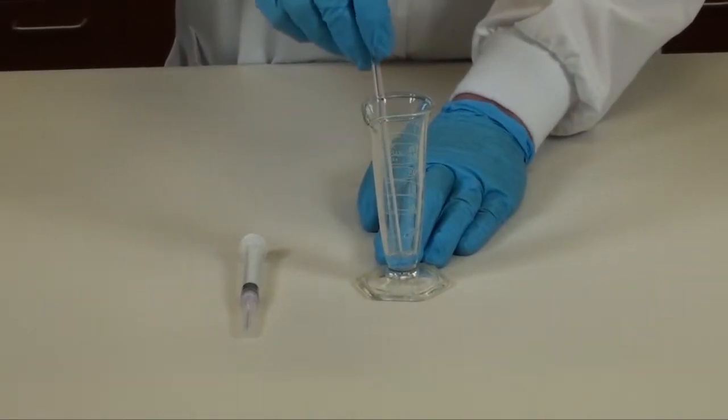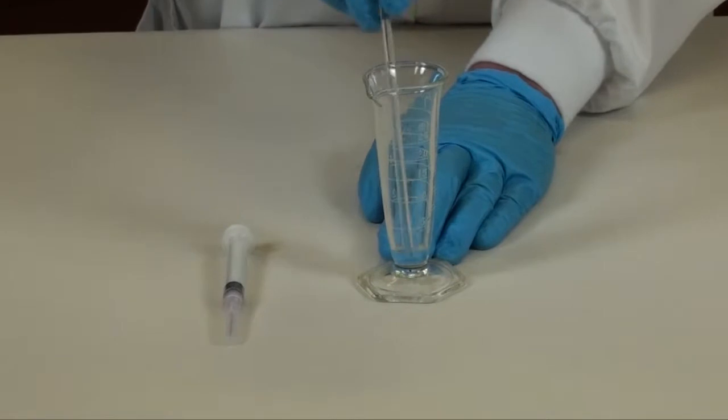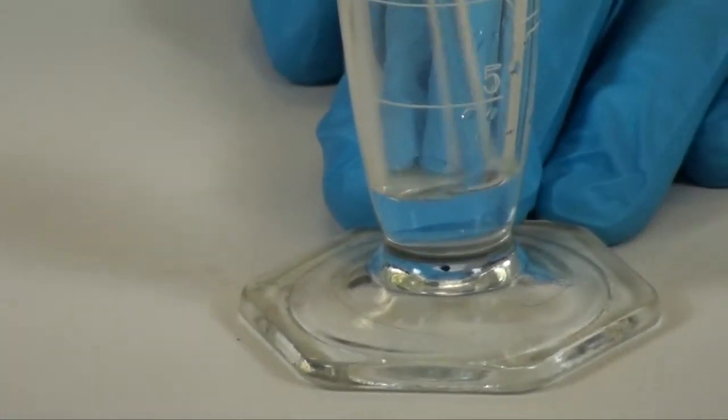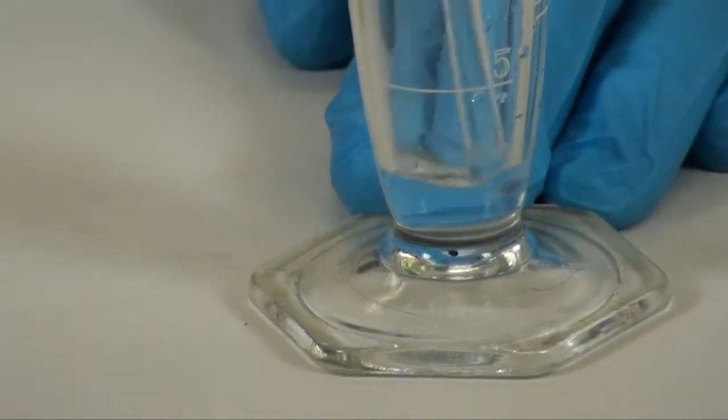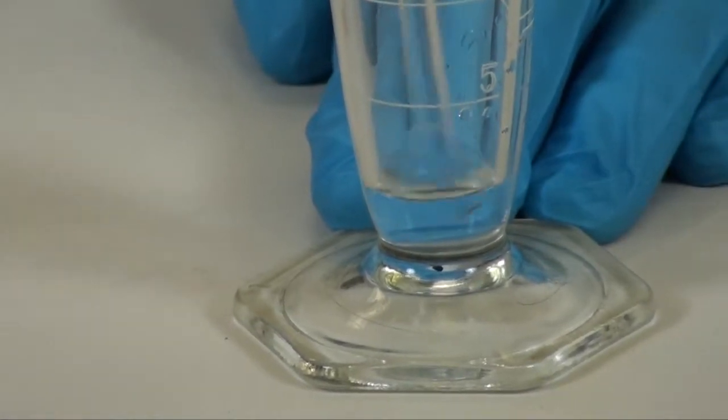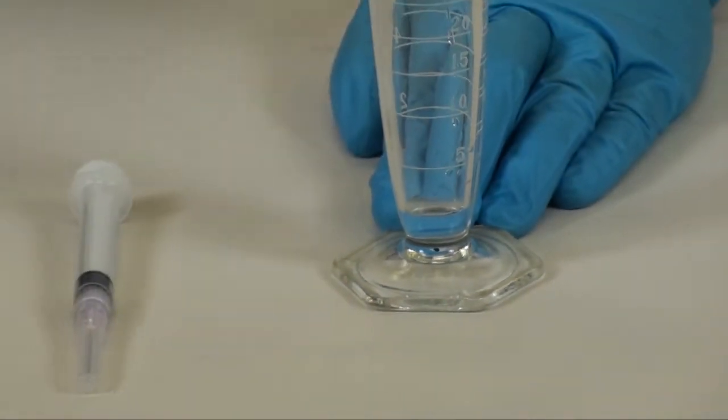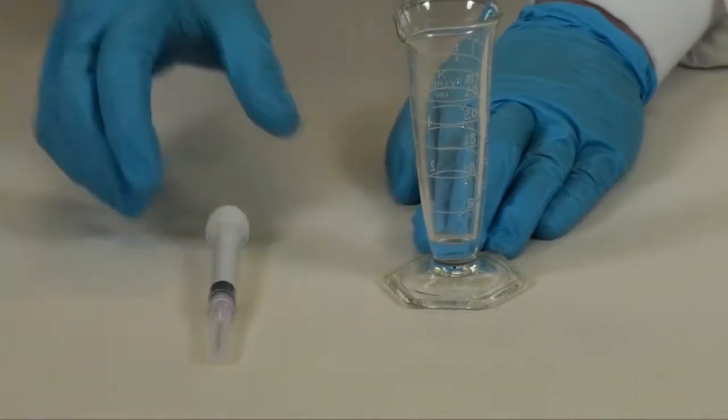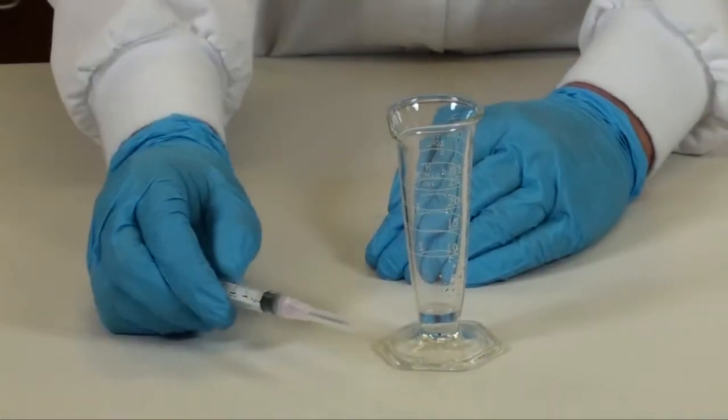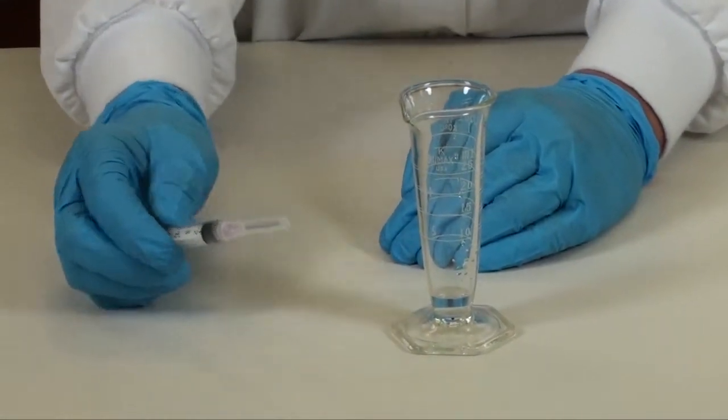In this step before we withdraw the acyclovir solution and lidocaine from the graduated conical, we want to be sure it's in solution. Once you're sure it's in solution, gently lay your glass stirring rod and use the 3ml syringe used previously.